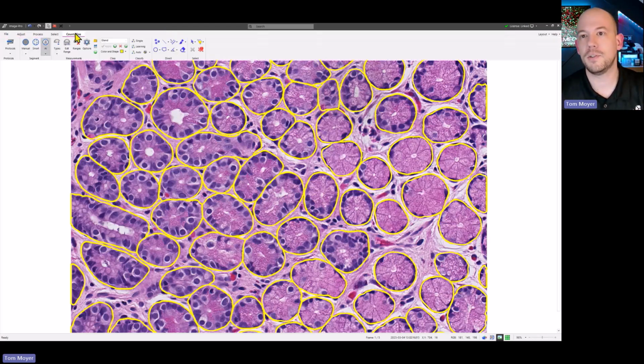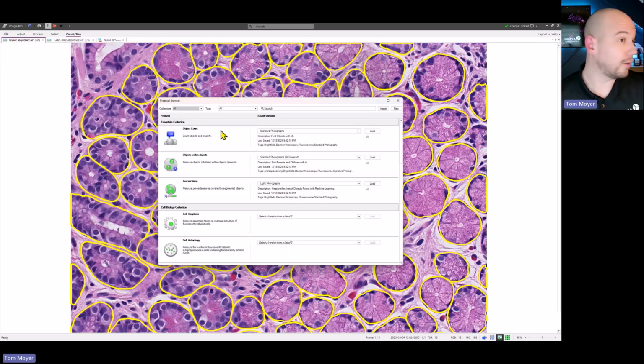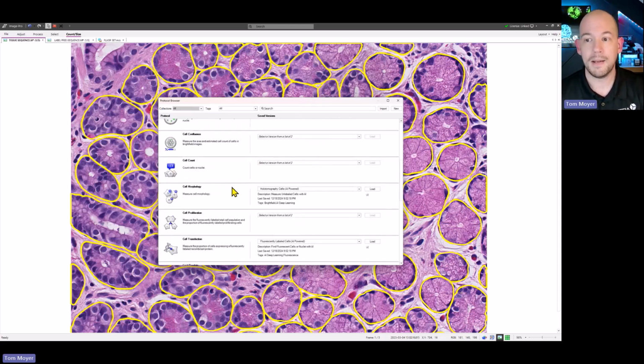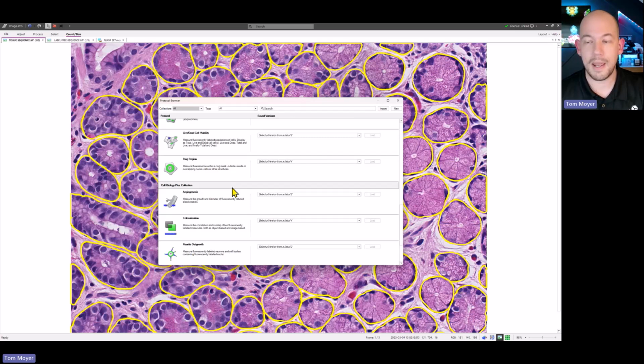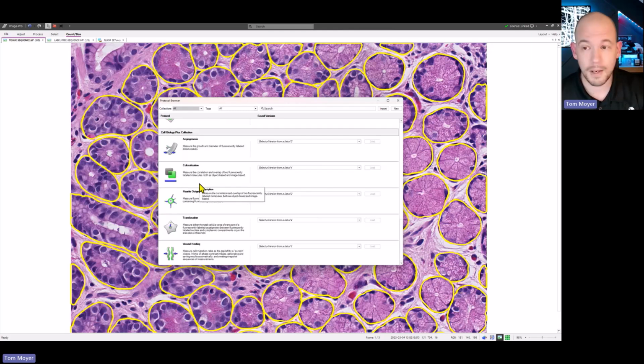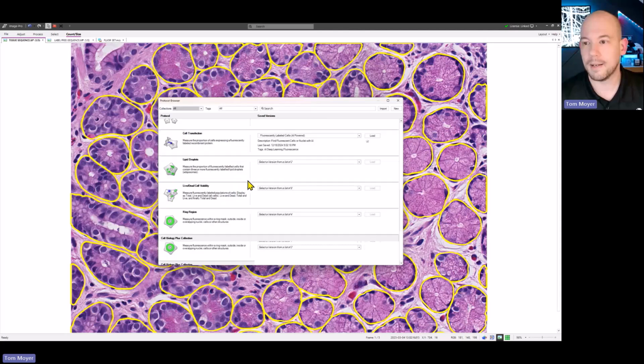So this is where we need to create some sort of workflow or a step-by-step process to first find the objects within the image and then extract data from those images. So within the protocol library, again, we have some life science specific, some material specific collections that include things like cell-based analysis, apoptosis, autophagy, cell morphology, lipid droplets, everything that Nick had highlighted in the previous slide, and some more complex types of analysis like co-localization, neurite outgrowth, wound healing, etc.